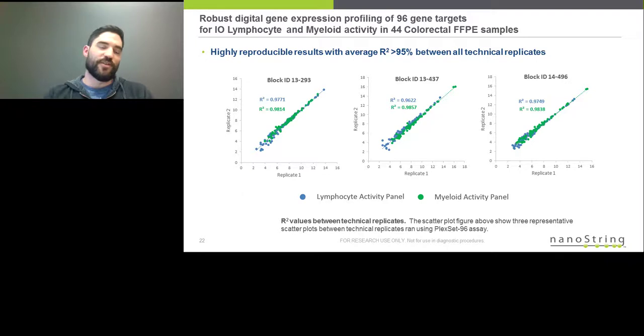They went away. These are log2 base counts on the left. So next to replicate 2 and replicate 1, it goes 0 to 16. Those are log base 2 counts I'm showing. And again, highly reproducible data when you look at the 2 technical replicates for these.